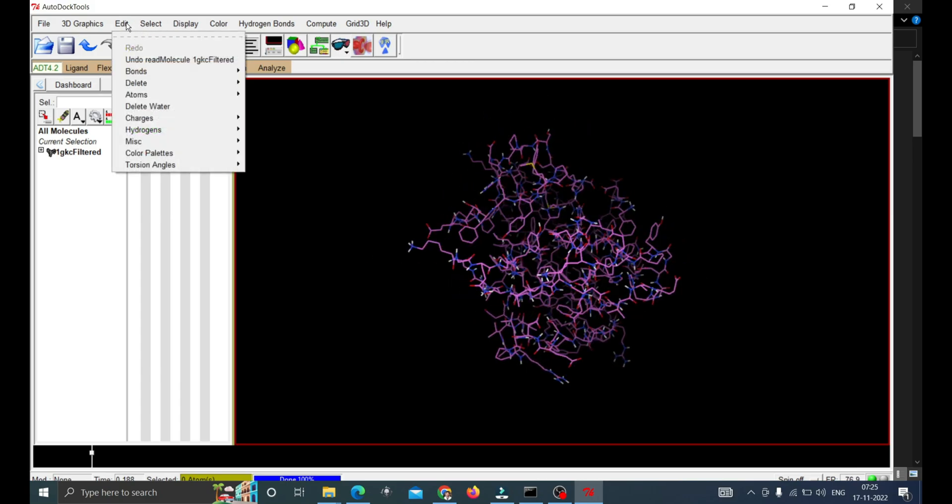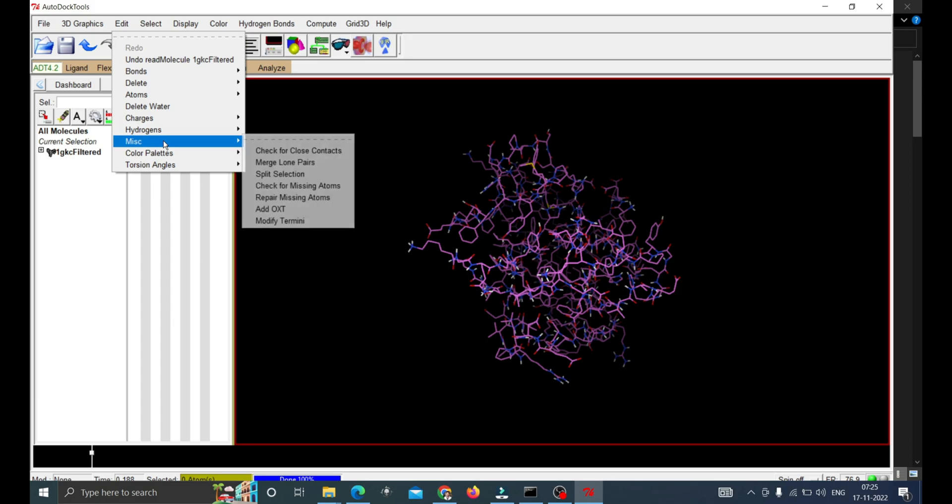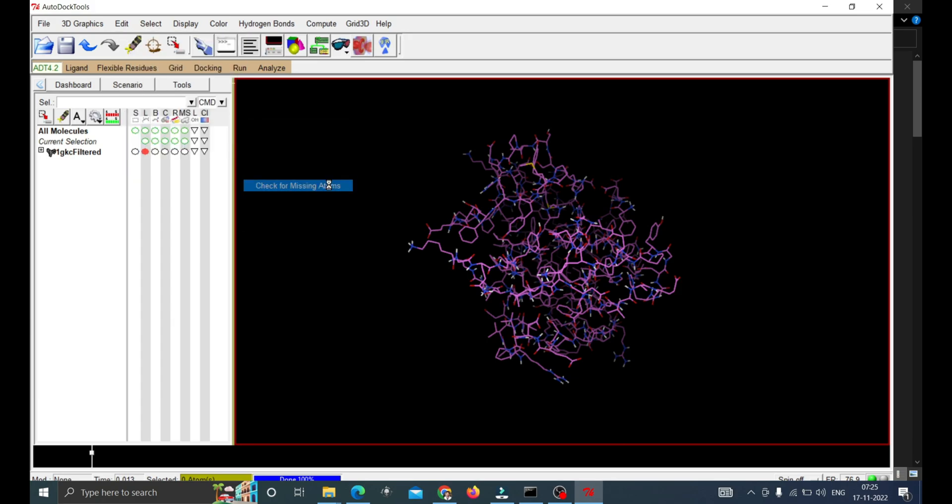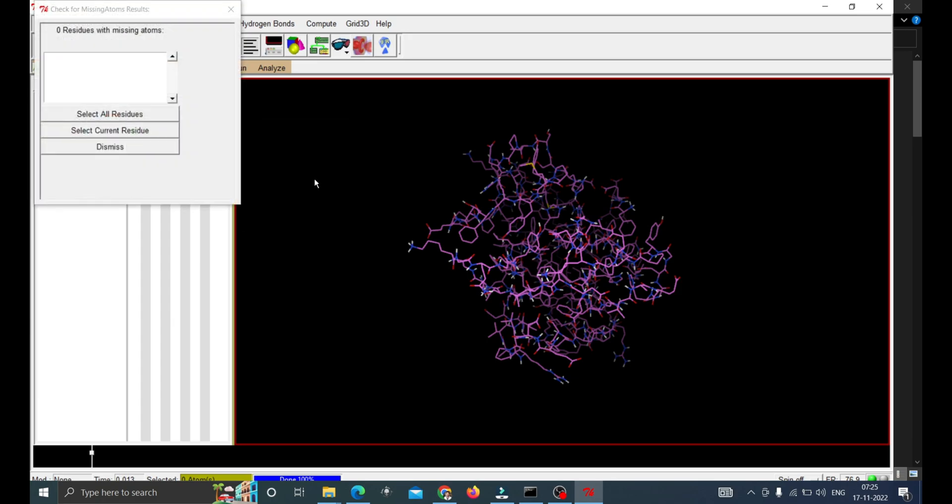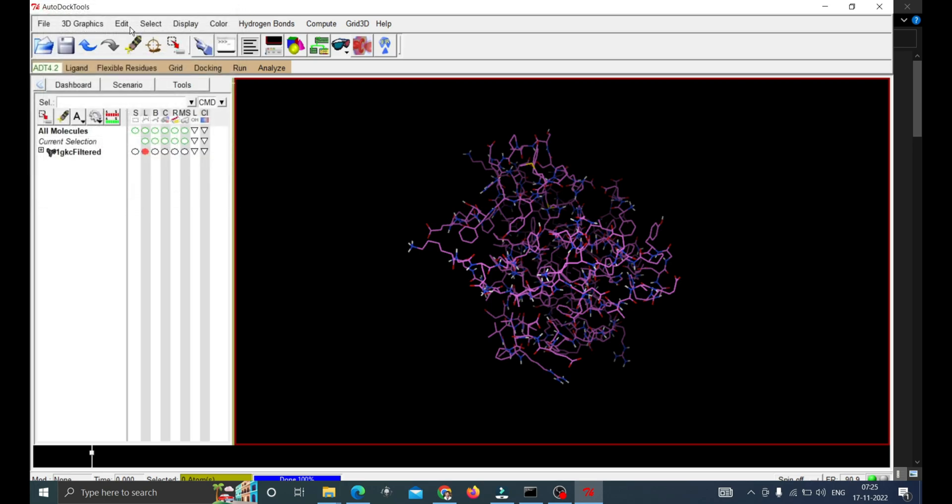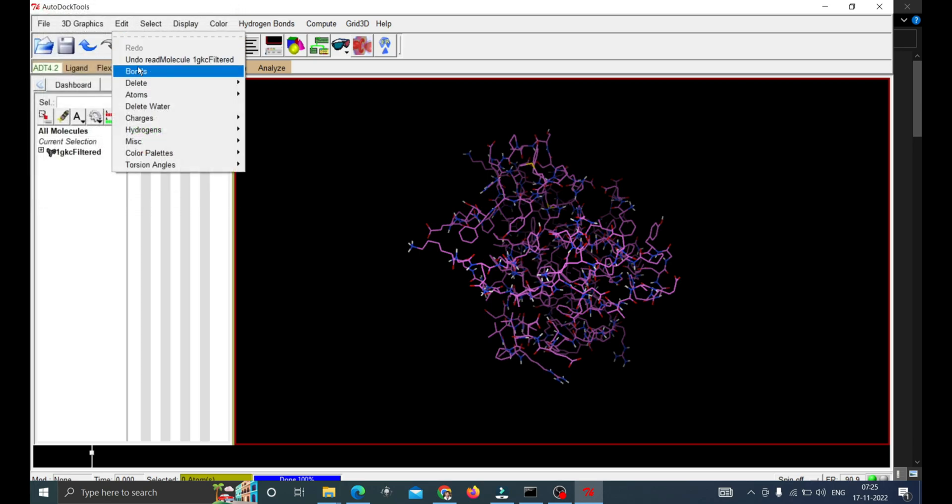Now go to Edit again, go to Miscellaneous and check for missing atoms. If there is any you have to select those and click on the Repair Missing Atoms in the same section. Close and click on the Edit again.